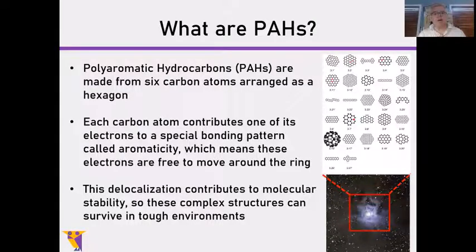If you take a look on this slide, you'll notice that there's a collection of PAHs, all sorts of hexagonal rings, all that have been found out in deep space by NASA using spectrographic analysis of emission lines from places like the Iris Nebula, which is over 1,100 light years from Earth. So they're easily formed in nature, and they're found in some of the most unusual places.